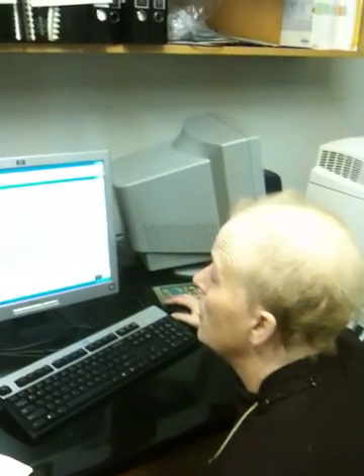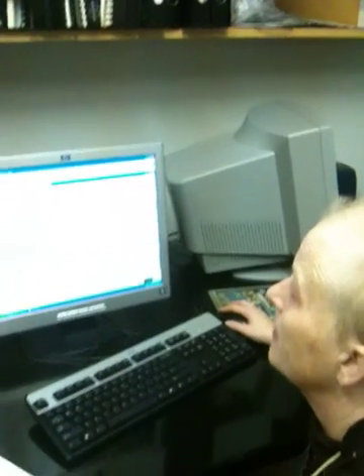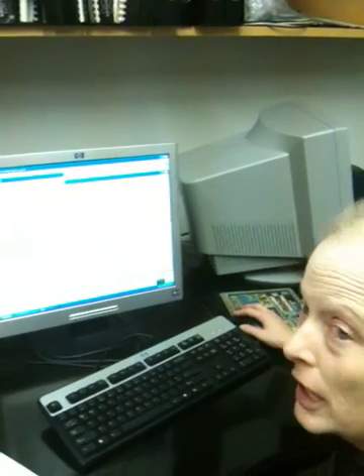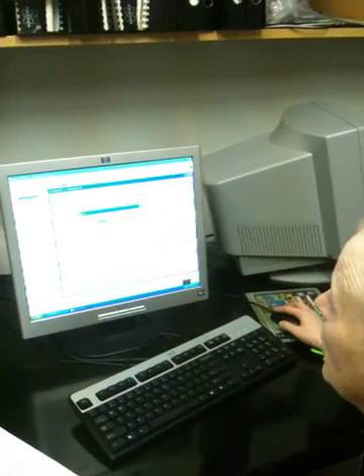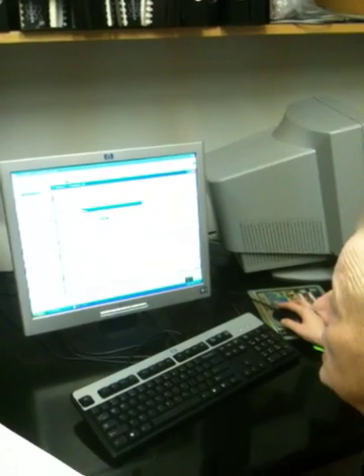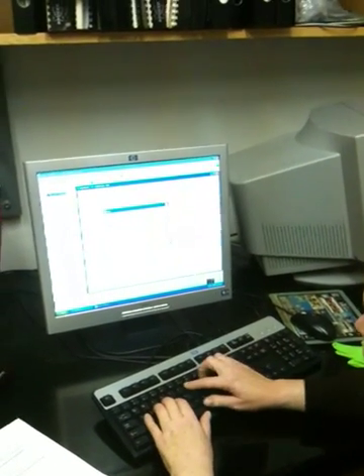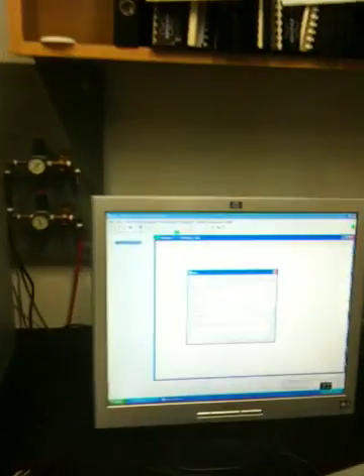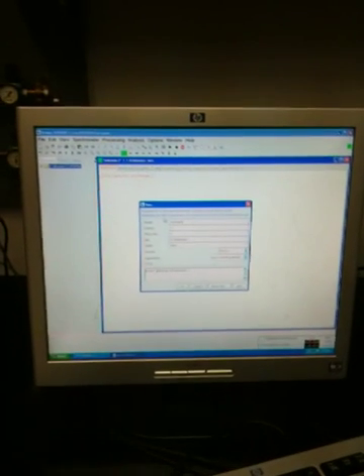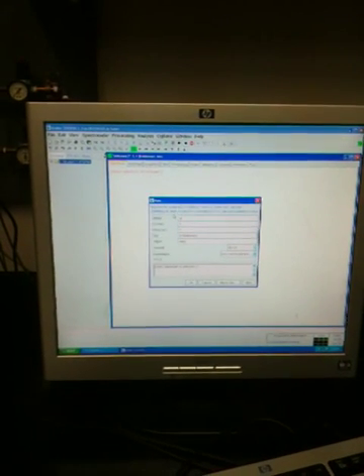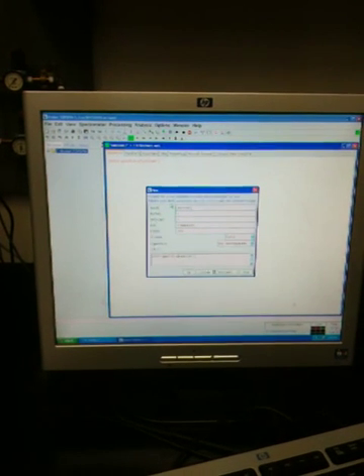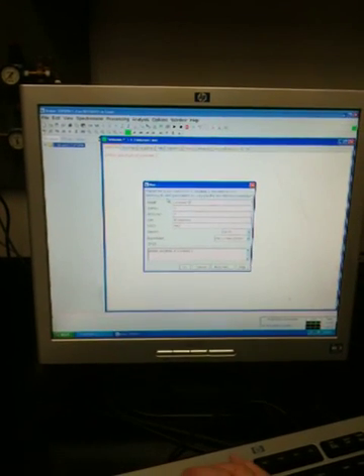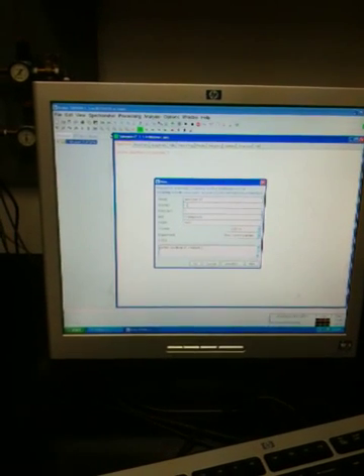To start running a spectrum, you need to go to File and click New. You want to write in what sample you're running. So I'm going to say this is unknown 52. I'm just putting a number down.